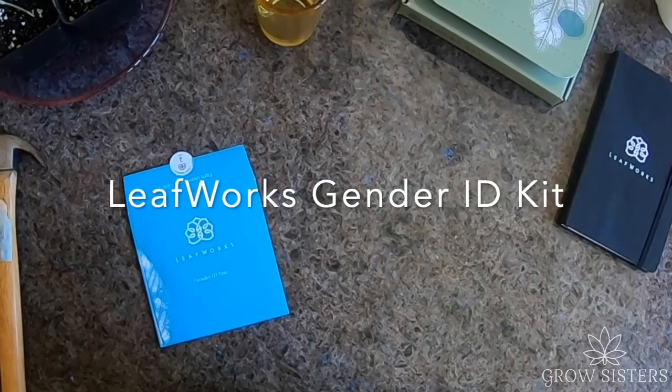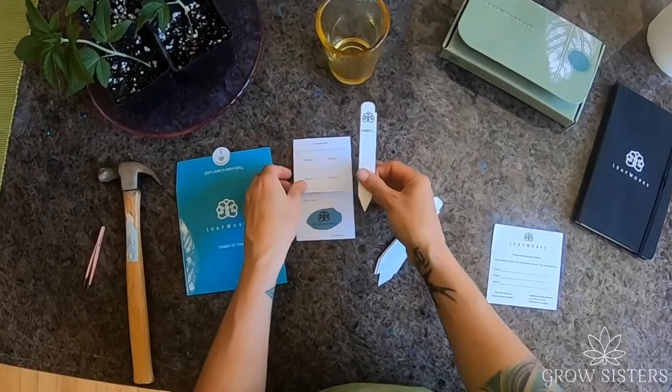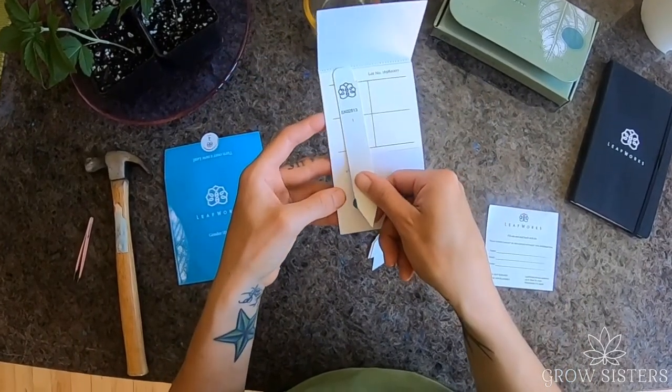The LeafWorks gender ID kit comes with a collection card, four plant stakes, and a return card. Each plant stake corresponds with a quadrant on the collection card.